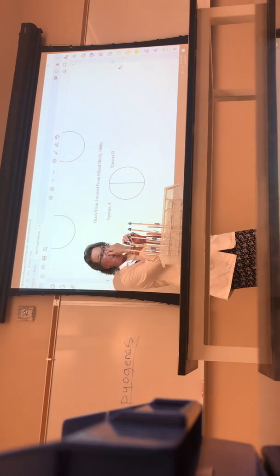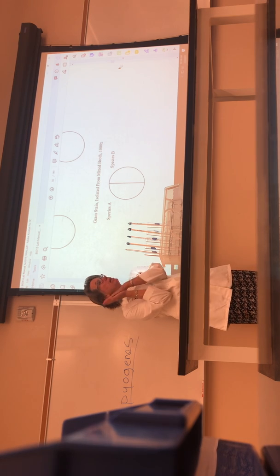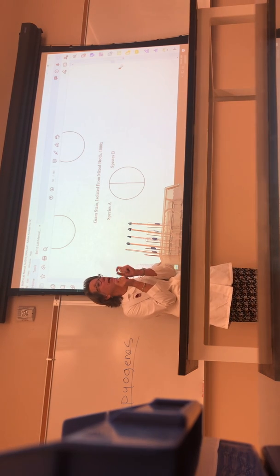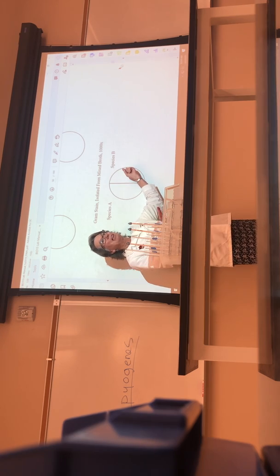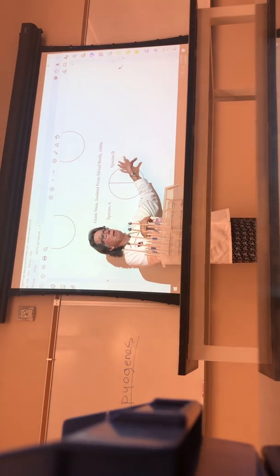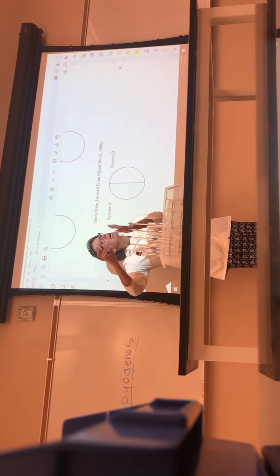So today you want to confirm your gram stain of whatever you got on the slant. So you're going to get your slant. The slants are all at 30 degrees. You're going to gram stain that and try to do a good one and make sure it looks like you think it should. How many of you actually saw your gram positive on the plate, but it didn't grow on McConkey, okay? You already know which colony type is your gram positive.